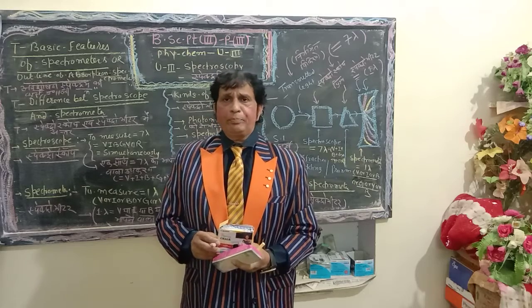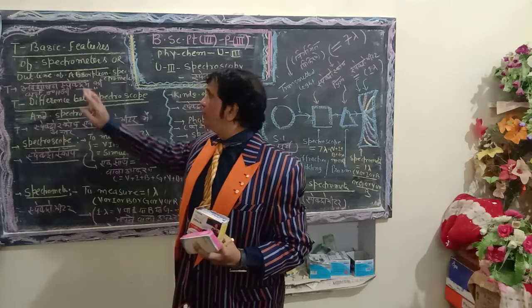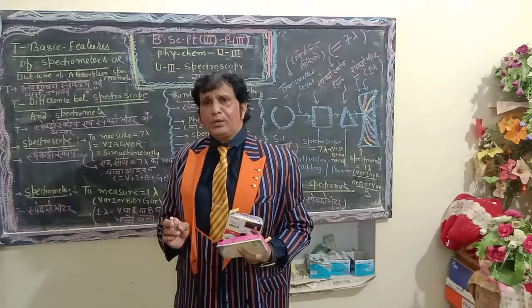First of all, let us define today's topic, the outline of absorption spectrometer, or the basic features of spectrometers.